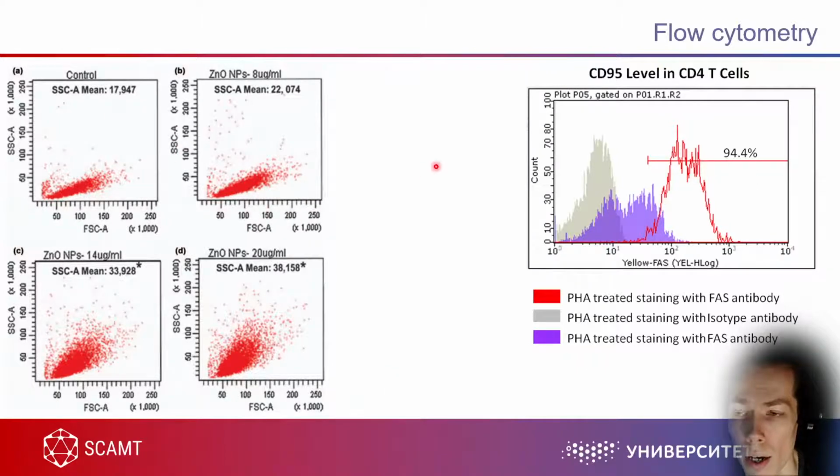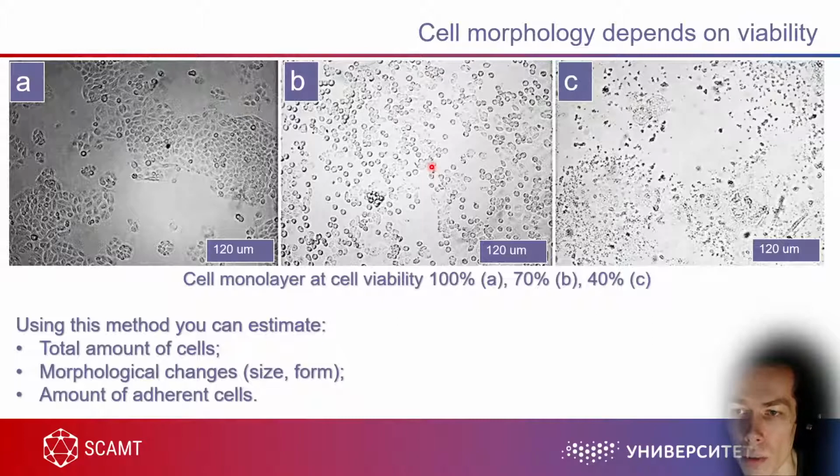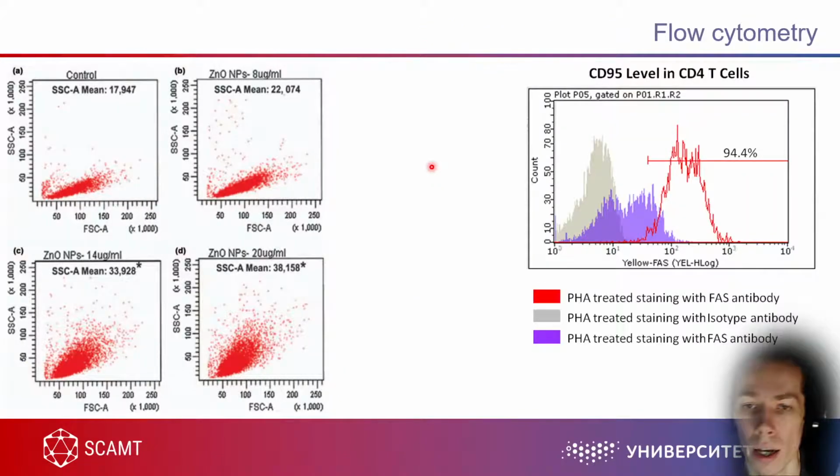So your cells, when they are passing through the flow cytometer, go through very narrow capillaries, and in these capillaries there's a light, and different cells differ in internal structure, so it can be a granulation of the cytoplasm. The cells may shrink or may expand, so any morphological changes will be represented on these plots.